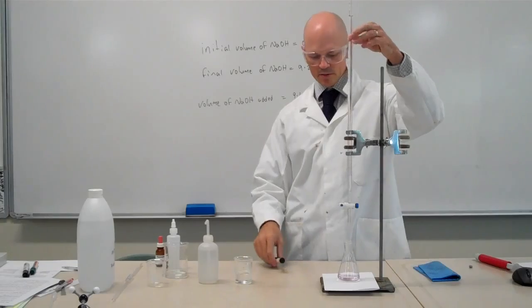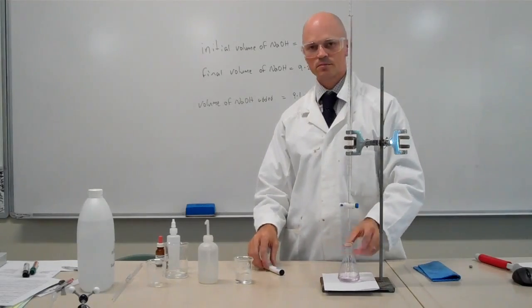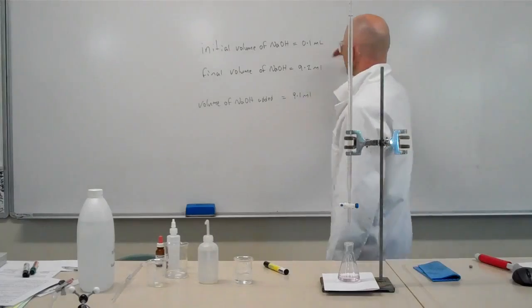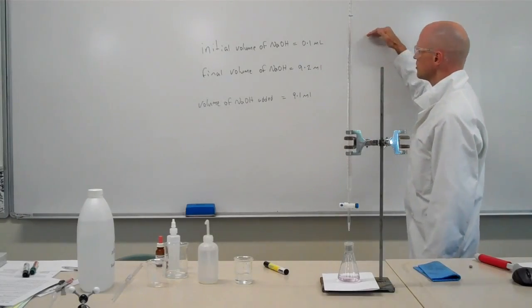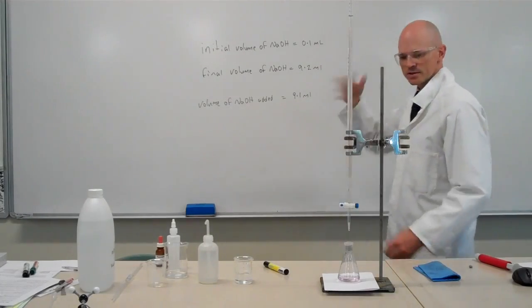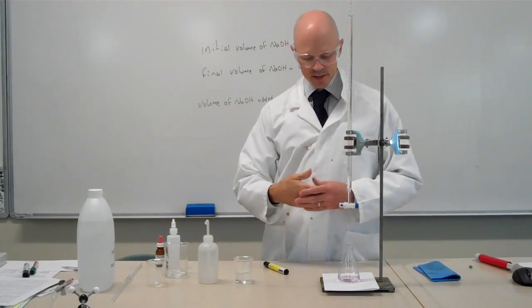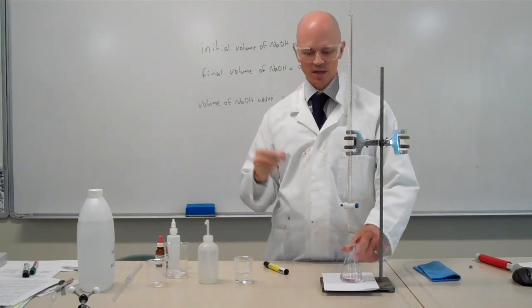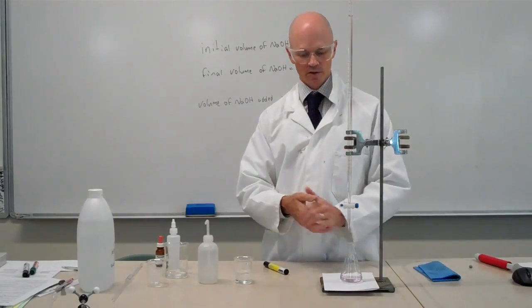Now I would then repeat that whole titration at least twice more. So I'd start off with my initial volume as 9.1 ml and then I'd just do the same process. You need to have at least three very consistent results. That's within about 0.1 ml of each other.